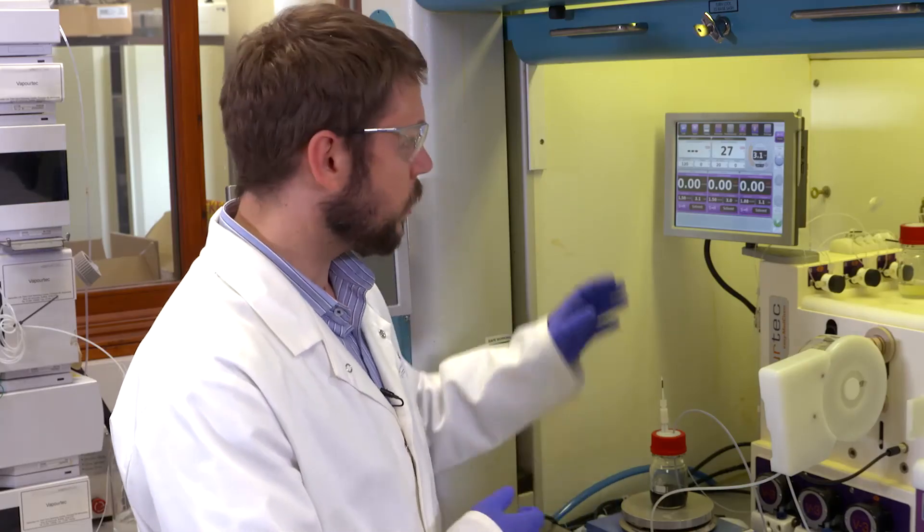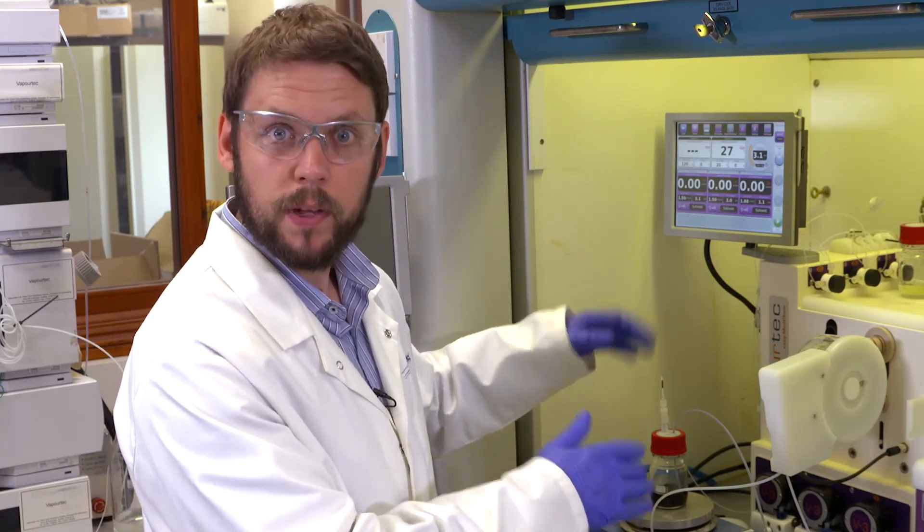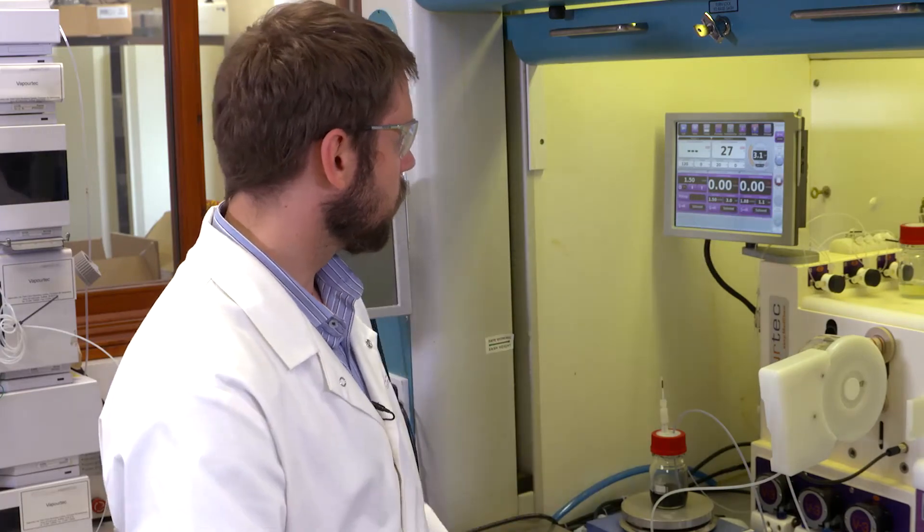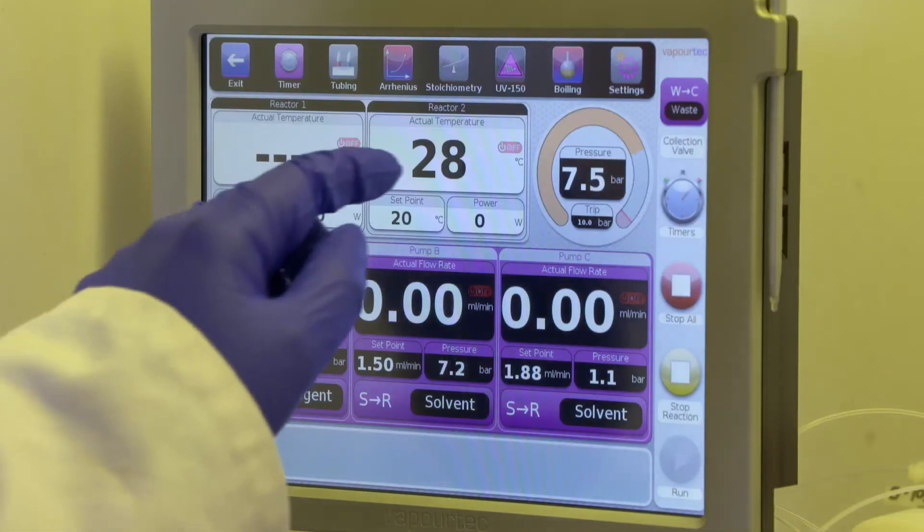So now everything's ready I need to use the solvent to reach the pressure that I want and then I can start heating. Now that the system's at pressure I can begin heating.